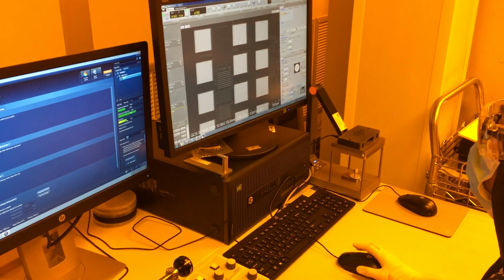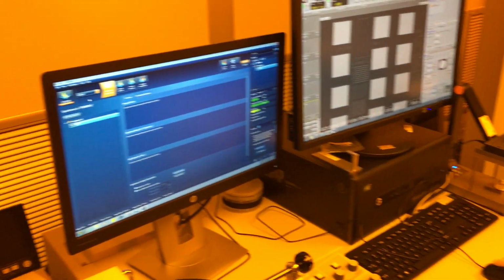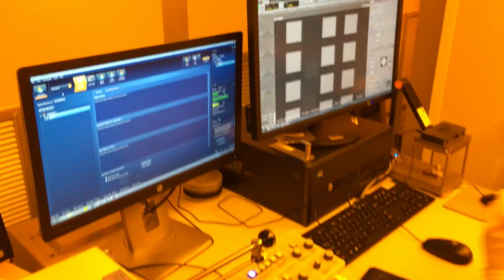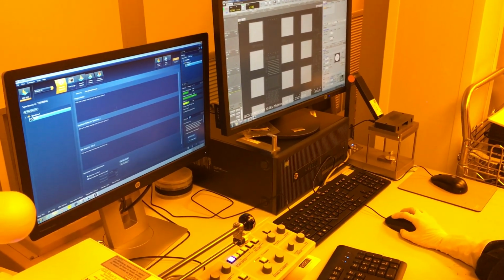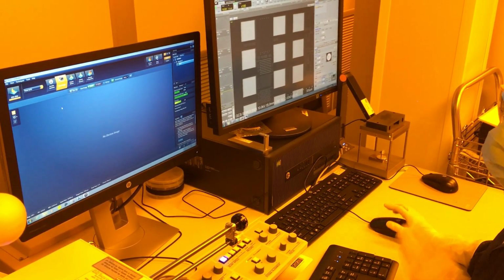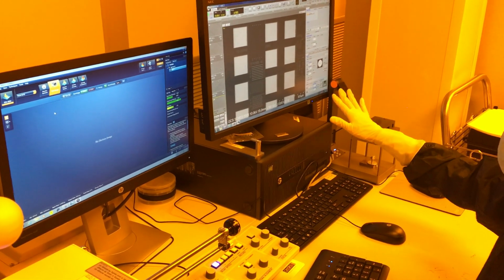That's good enough. And for this example, I'm going to use point and ID. Point and ID allows me to scan the entire image and select specific areas to just scan those areas. So I'm going to move on. You can describe your specimen. This is optional. Go to scan image. So once I scan an image, I do not change my magnification or shift my sample.